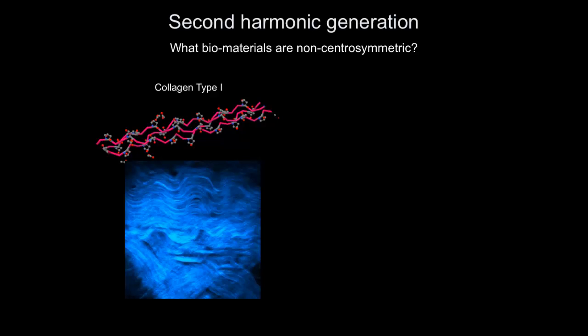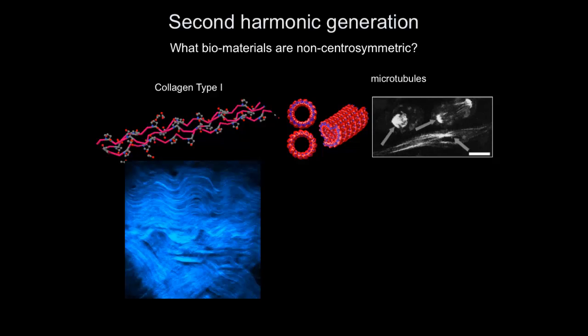I have not added any label to this molecule. This is the molecule itself that generates this signal. So this is label-free imaging of collagen. Very useful. What else?